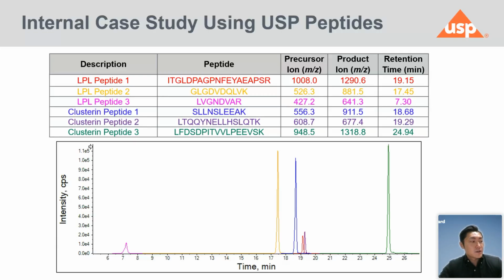For each of the labeled peptides and the associated unlabeled peptide, an MRM-MS method was developed. You can see the MRM parameters in the table above, which shows the precursor ion, the parent ion, and the daughter ion, as well as the retention time. You can find the sample chromatogram for each of the labeled peptides as displayed in this slide.